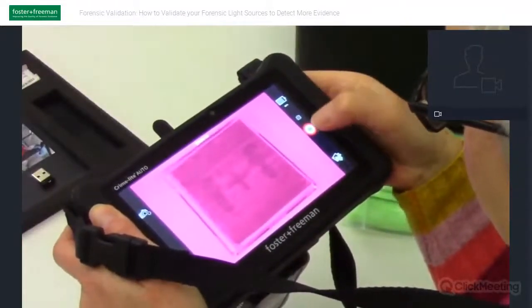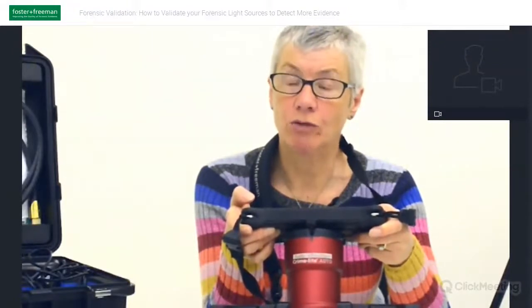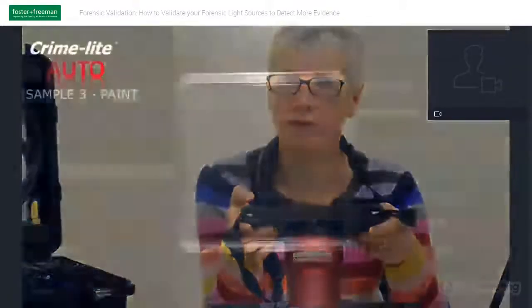Another paper by Andrew Farrar concludes bloodstain evidence can be detected beneath up to 6 layers of paint. This technique provides CSI with a new field method to assist in locating, visualising and documenting painted over bloodstain evidence.